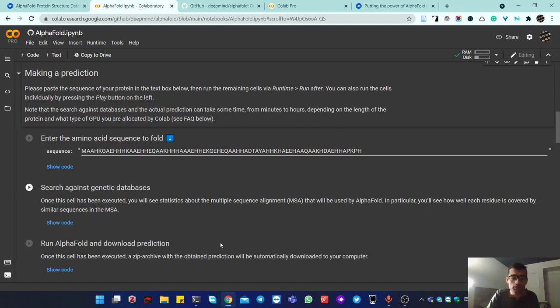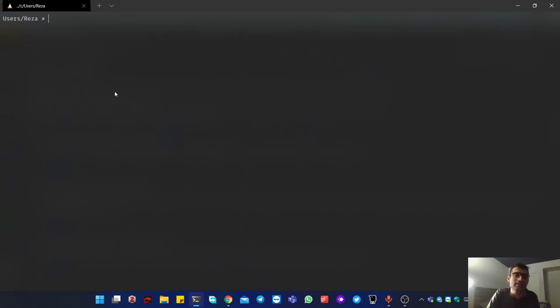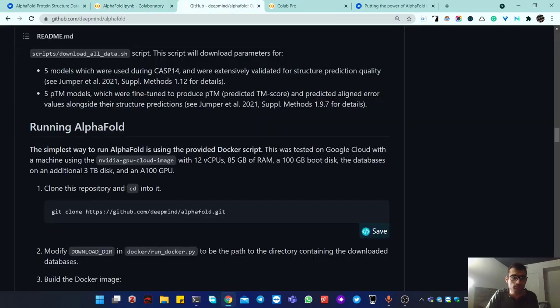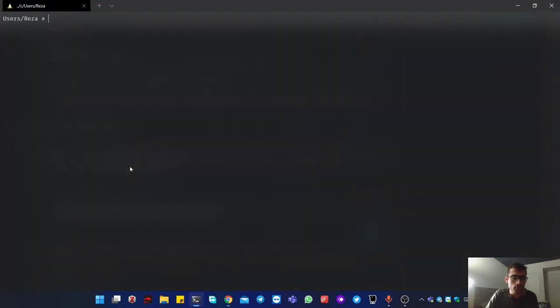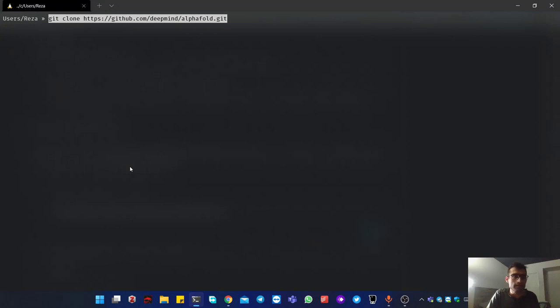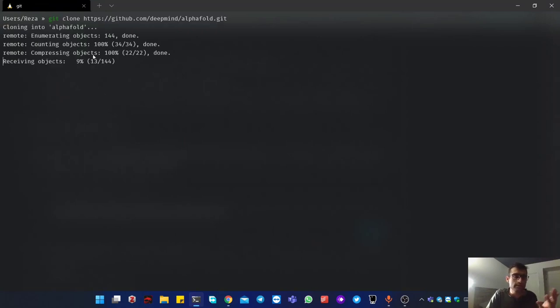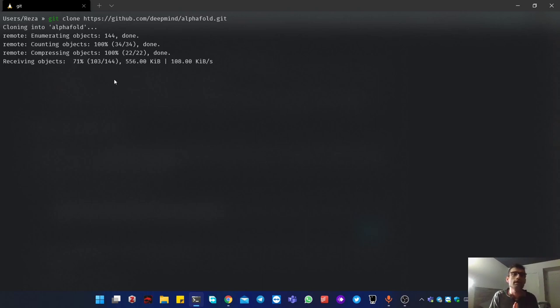If you're on Windows, you should use WSL2 — Windows Subsystem for Linux. There are several YouTube videos that can walk you through installing it in under 10 minutes. Once that's done, come to the AlphaFold GitHub page, copy the git clone command, paste it, and run it. This downloads the entire GitHub repository with all the information you need.